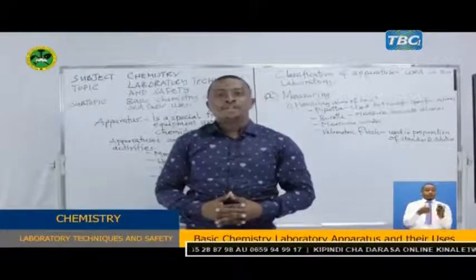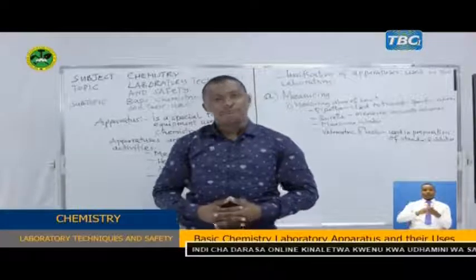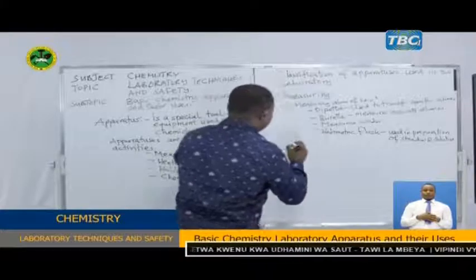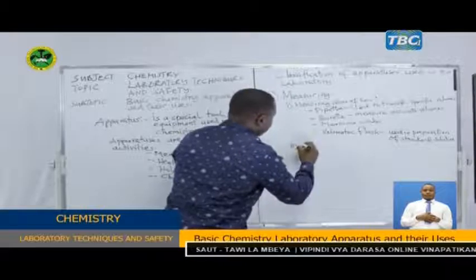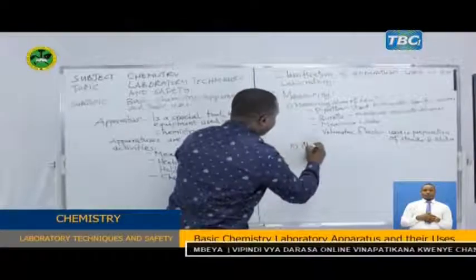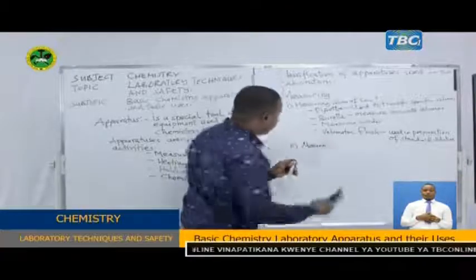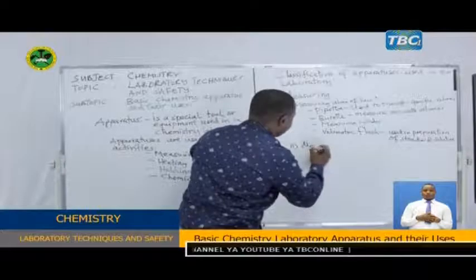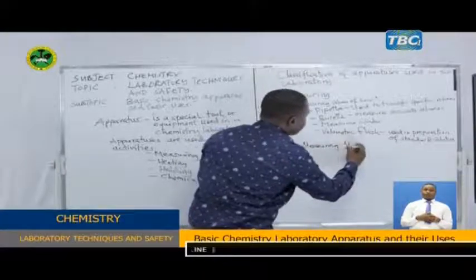Now, dear student, let us see the other apparatuses used for measurements. We have apparatus for measuring mass.